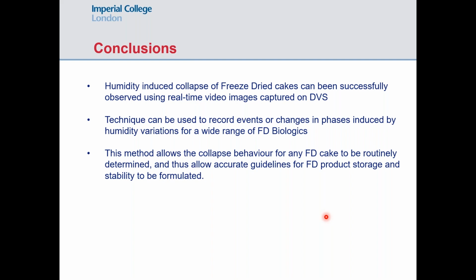So we can look at the freeze drying of collapsed cakes. If we want, we can also determine the surface area. The surface area using IGC is a bit more accurate, a little bit easier to do than using nitrogen. And we also can see that there's some variations in the surface areas of vials, which is intrinsic to the process. But IGC operating at room temperature and room pressure using octane, for example, can measure surface areas down to as low as 0.1 meter squared per gram.